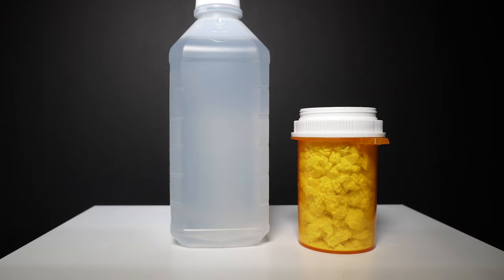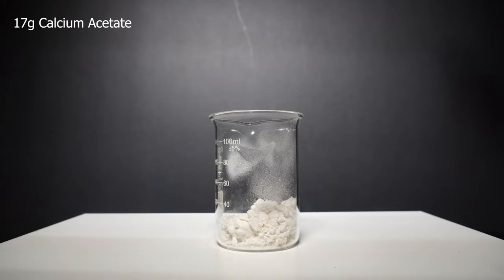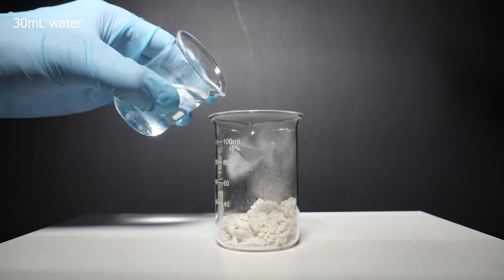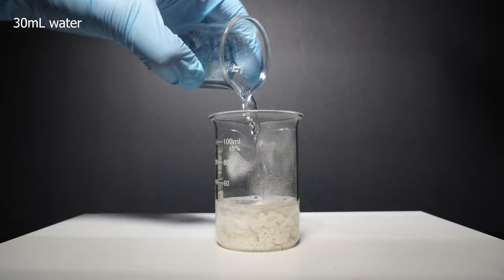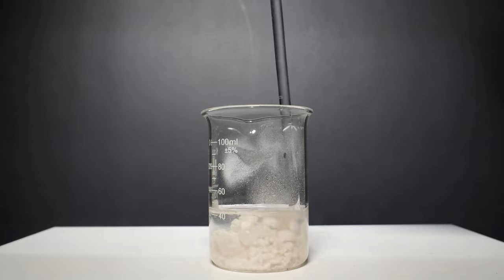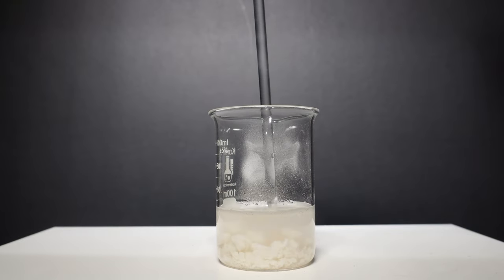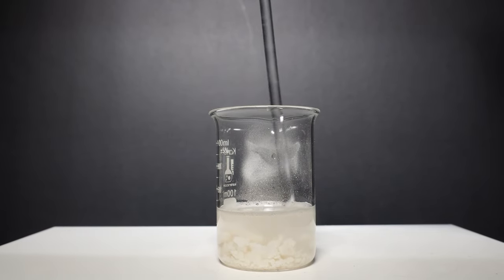To start off we will take 17 grams of calcium acetate which I have already added to a beaker. Following this we will add 30 milliliters of distilled water. I start by breaking up all of the larger chunks followed by stirring it around. This can take some time to dissolve though we really want as much to dissolve as possible.